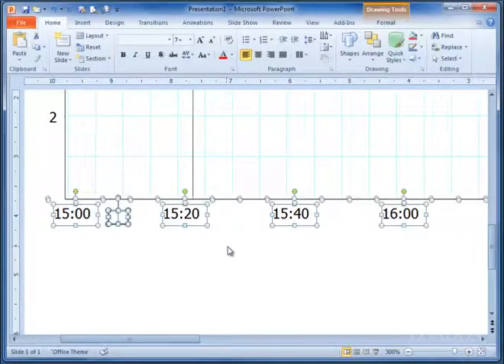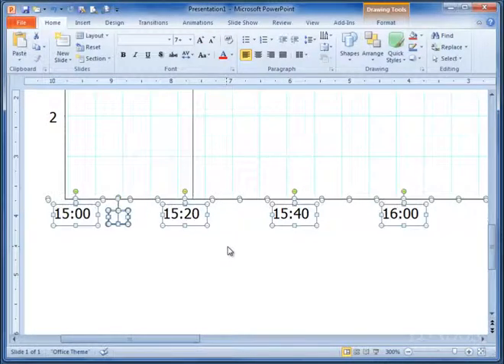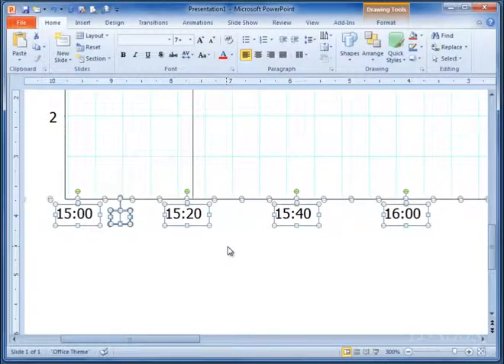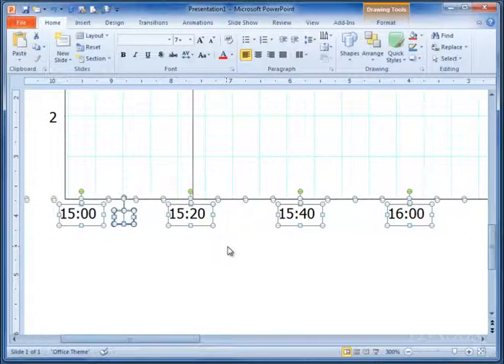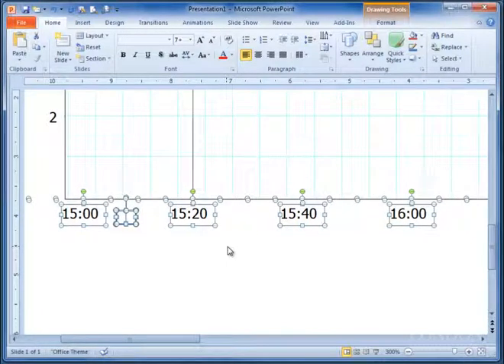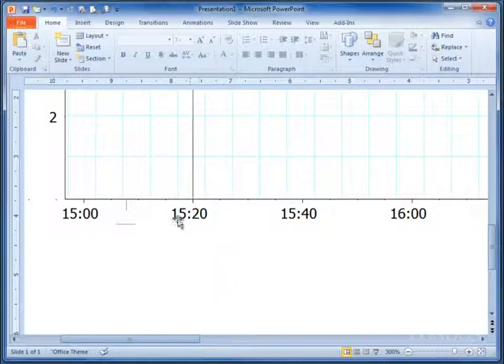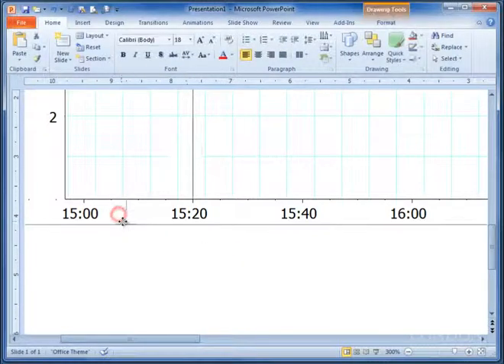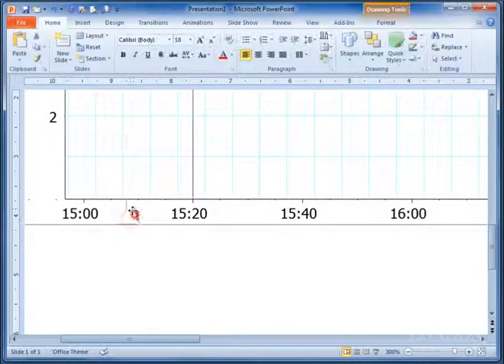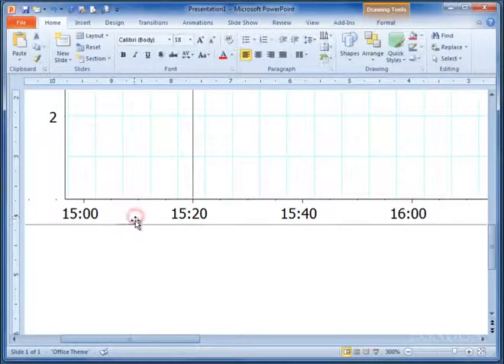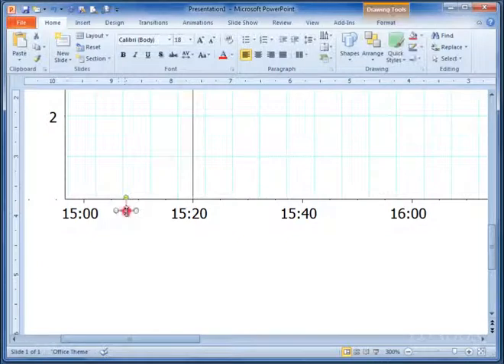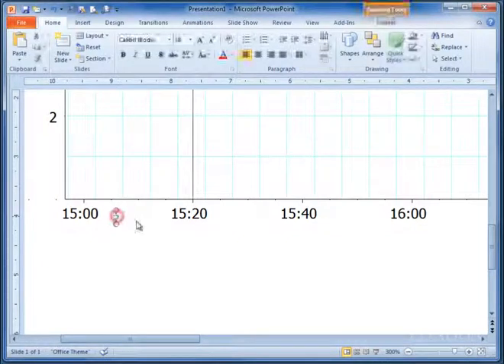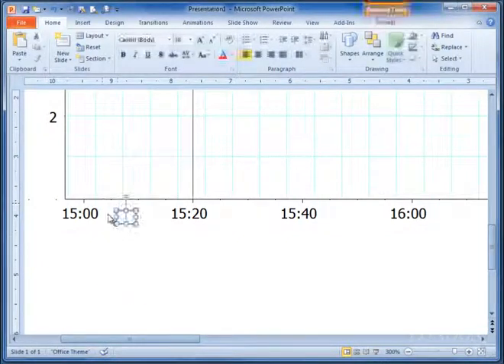So I'm going to just use the alt button, which is, oh no, I'm going to use the control button, which is for small changes, and make sure that is lined up absolutely perfectly there. And there we are. Now 15, 20 represents the start. I can then delete all this other nonsense that sat over here, and click on that for instance. I can click on that and get rid of that, and this little box made out of lots of other little boxes. I can delete all of that. Don't want that. This is no longer 1500, and we've got some little extras over here, so we'll delete them.